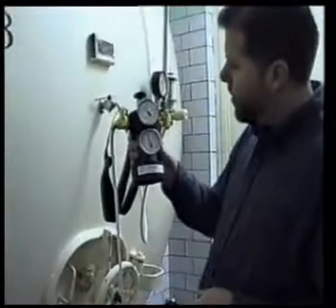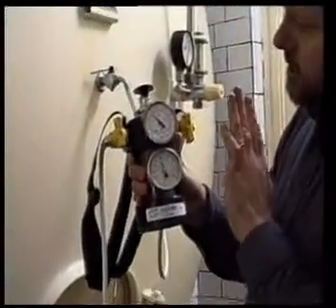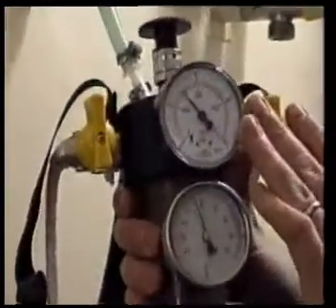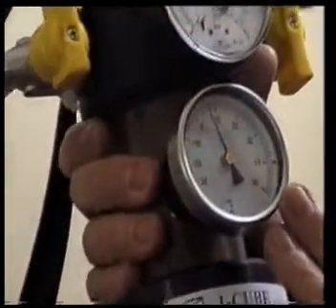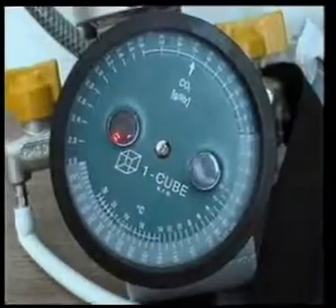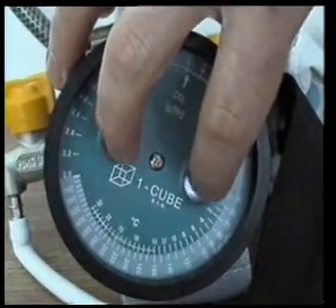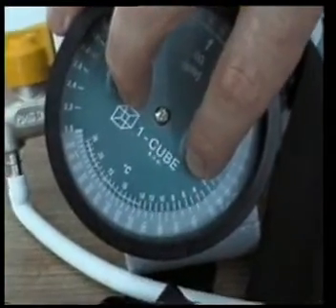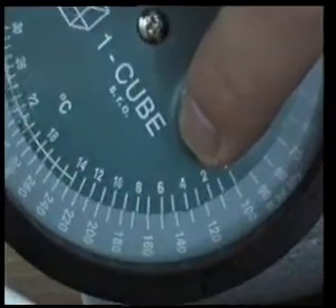Now you can read that the pressure gauge shows 1.4 bar and the temperature range shows 5 degrees Celsius. We look to the nomogram on the bottom of the device and at 5 degrees, we move the 5 degree mark to 1.4 bar.